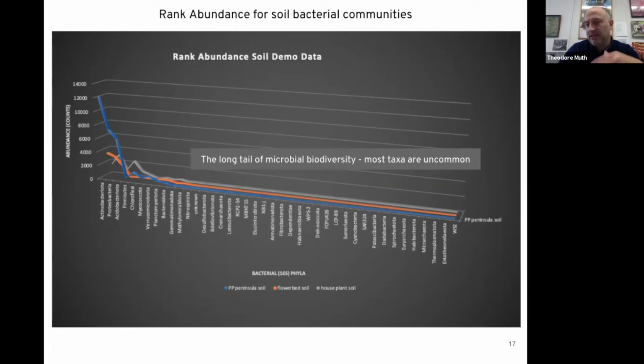For looking for contaminants, I wouldn't use this rank abundance plot. To answer your question, you could put all your samples in the Z dimension, lined up, and you might see some of it there, but that is easier to detect in a bar plot or some of the other analyses. But it's a good question.